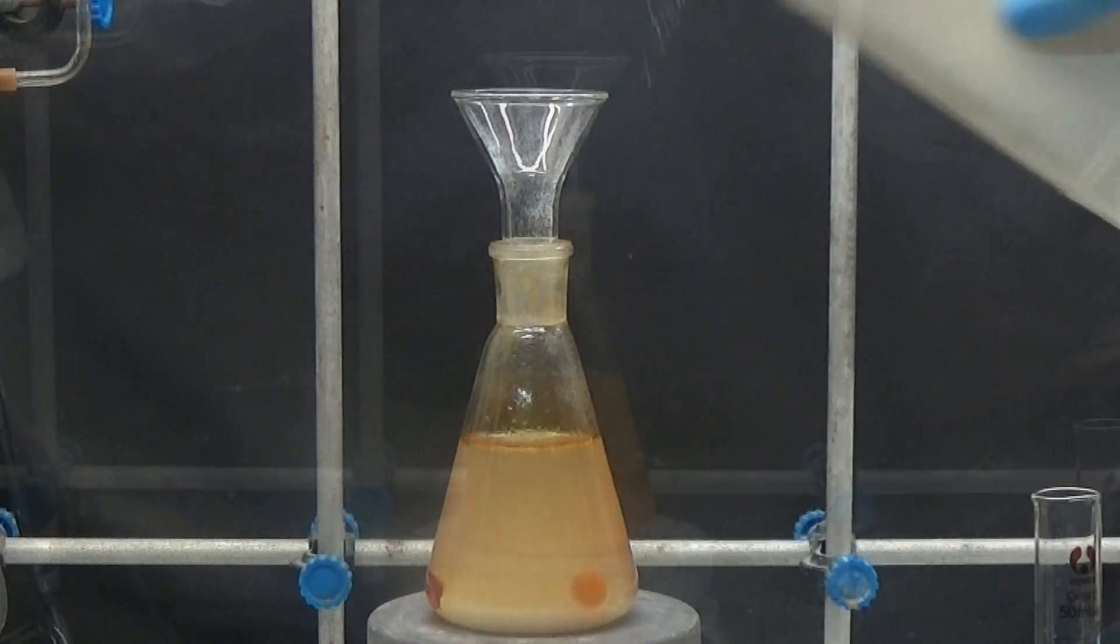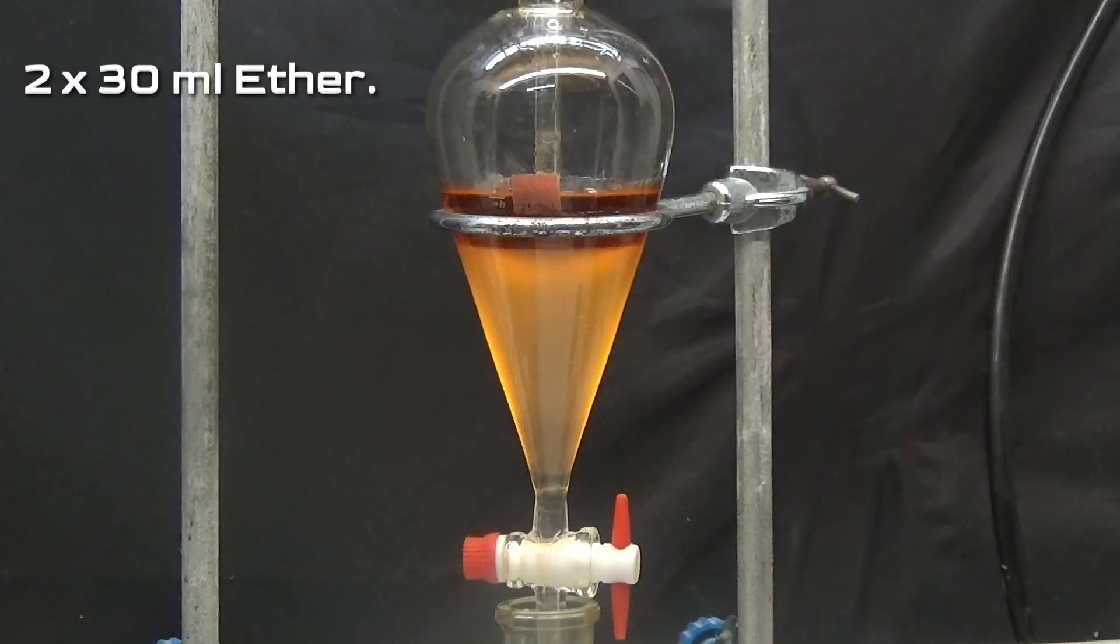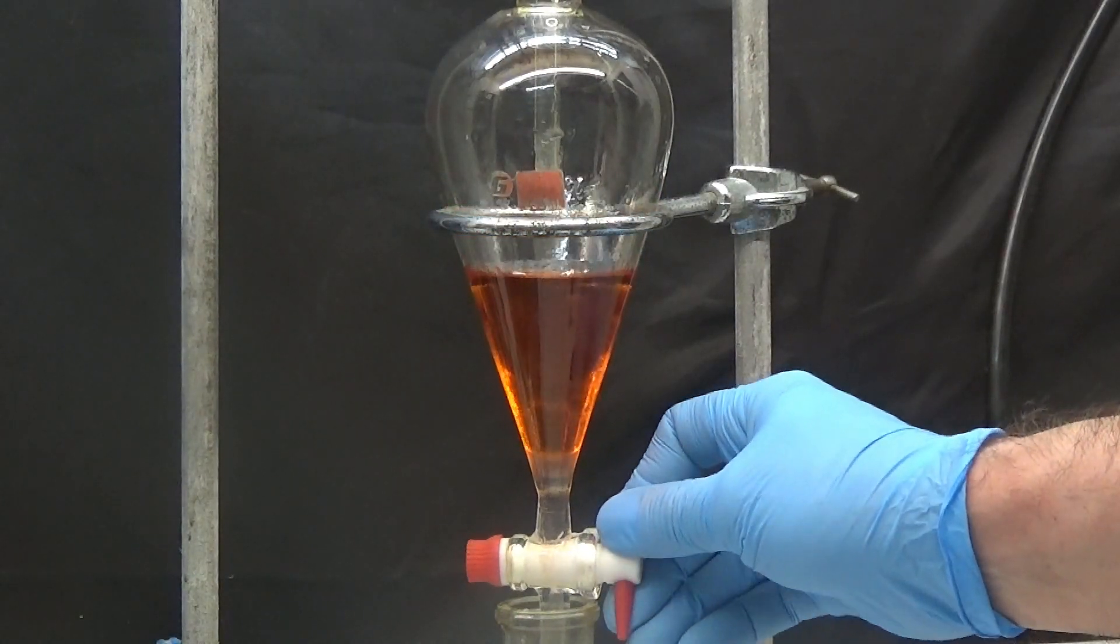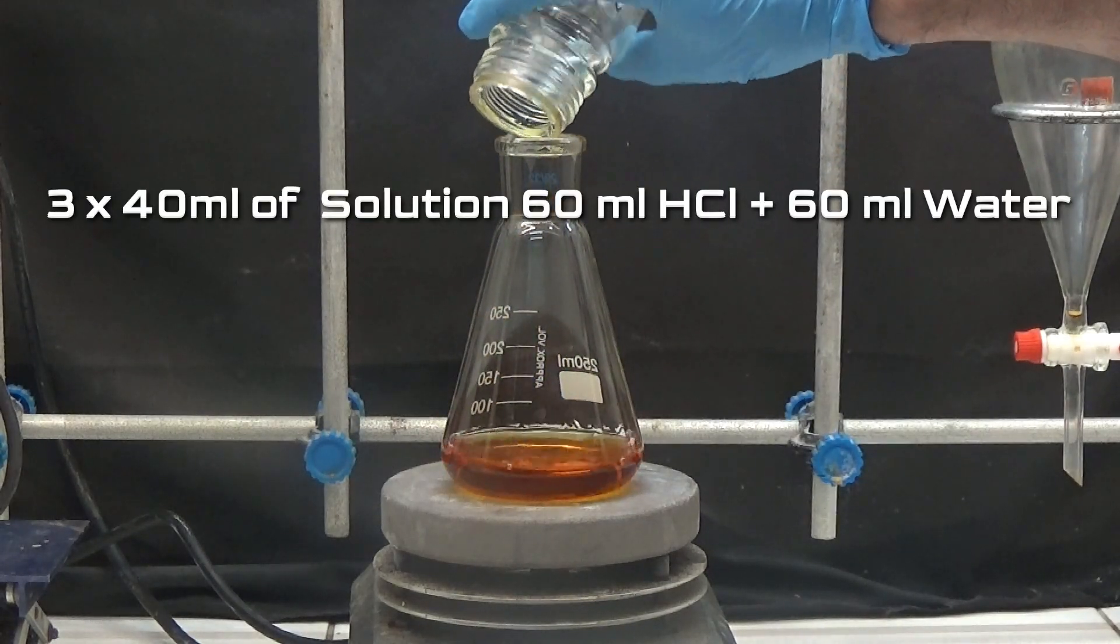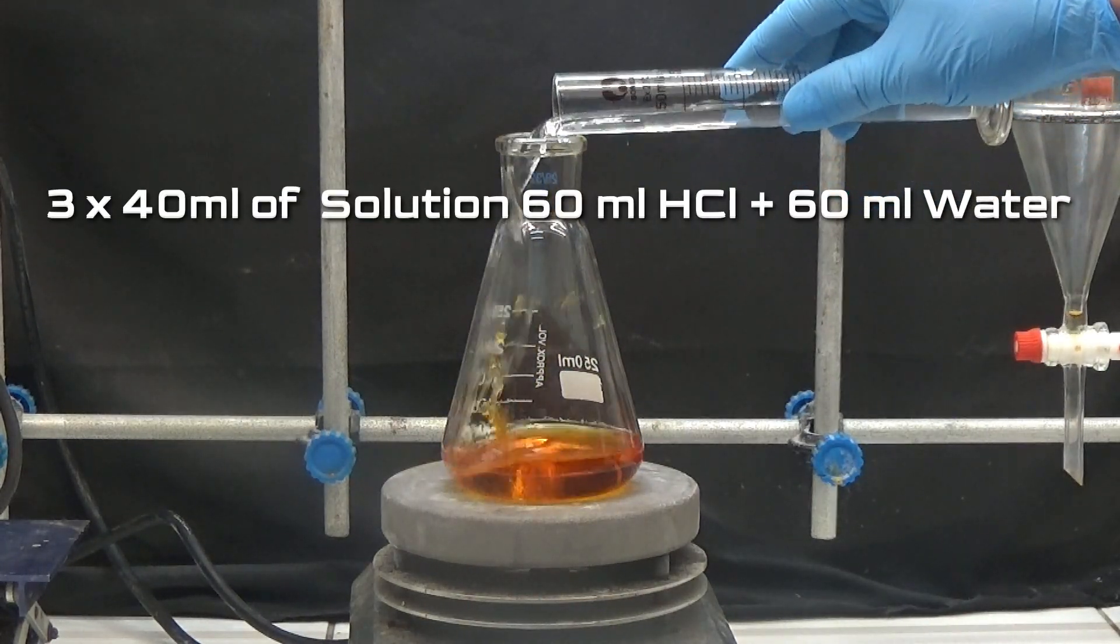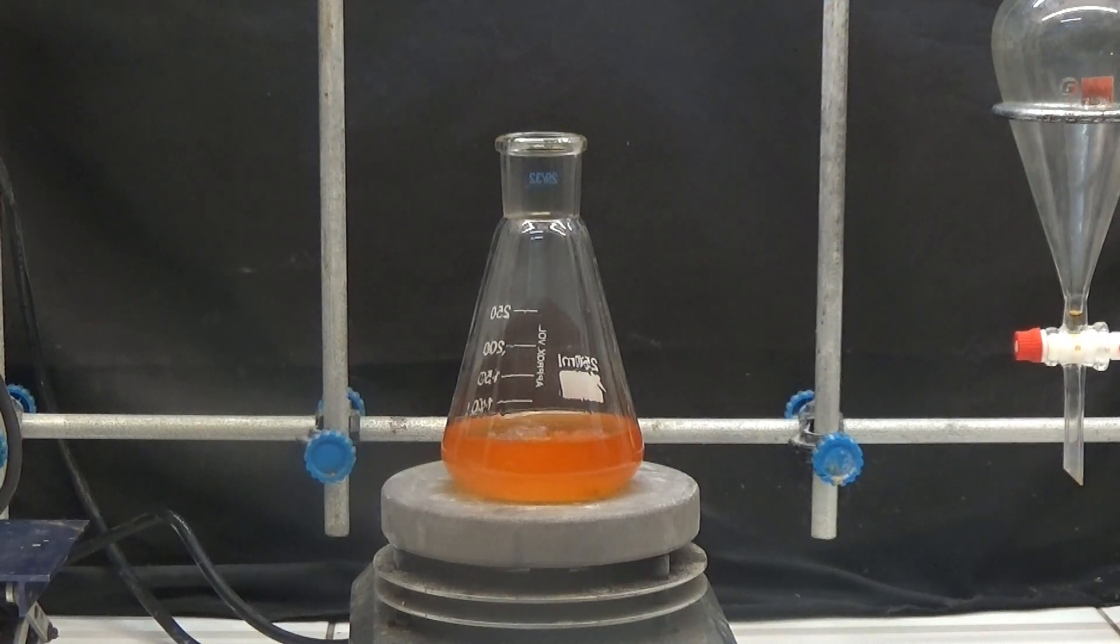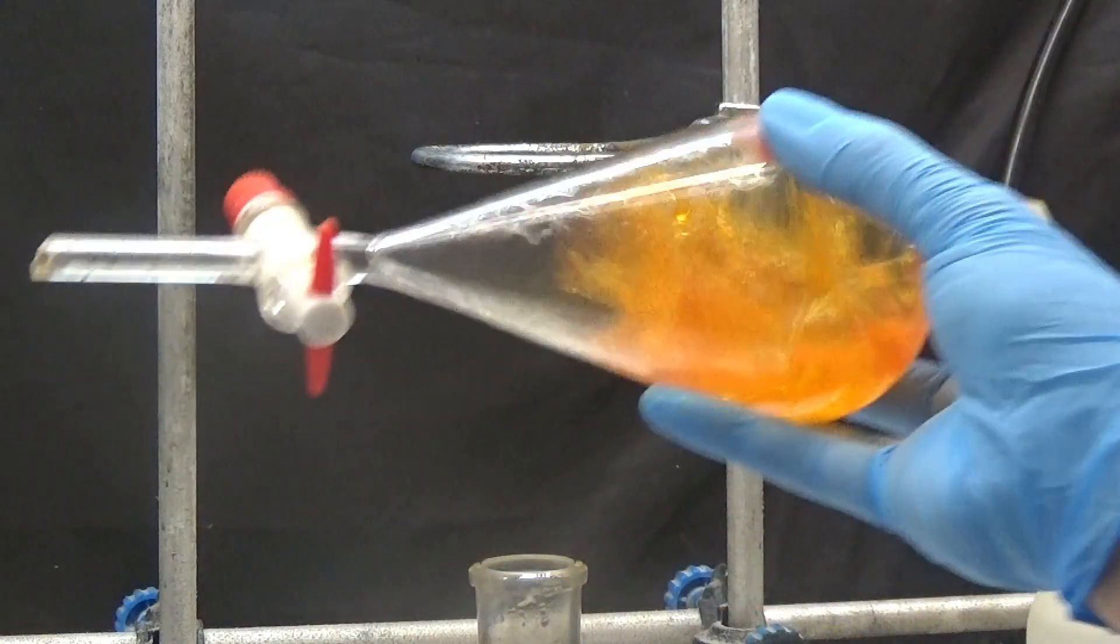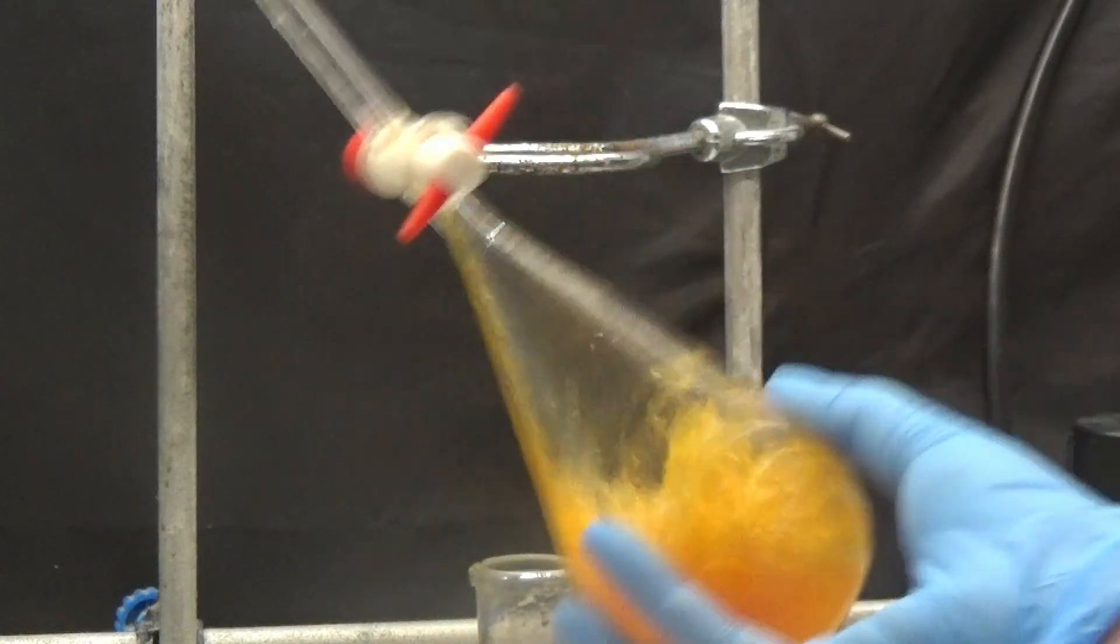Saturate the distillate with sodium chloride and extract the chlorotoluene twice with 30 milliliters of ether. Wash the ether solution three times with 40 milliliters of a solution of hydrochloric acid diluted in 60 milliliters of water. This is done to remove unreacted toluidine. Wash the organic phase with 30 milliliters of saturated sodium hydrogen carbonate solution and dry with anhydrous magnesium sulfate.